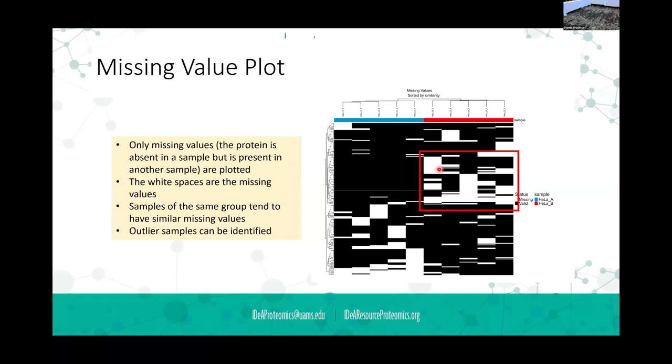I'm going to show you, because a lot of times a volcano plot is not very helpful for an IP experiment, because it's really presence absence. And so you are going to see blocks like that. When you have the differential analysis worksheet, you can sort and filter that, so you can look for only those that are basically all NAs in one group. On a volcano plot, those all show up as basically zero. They're not there because the group doesn't exist.